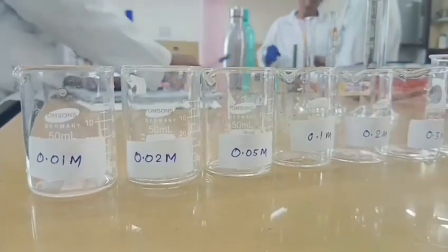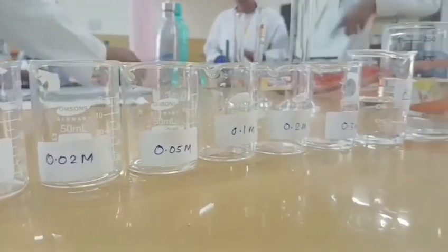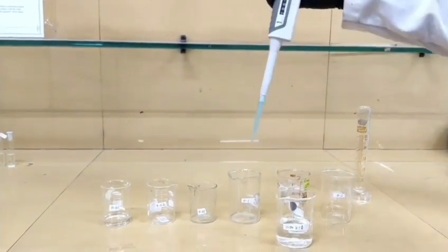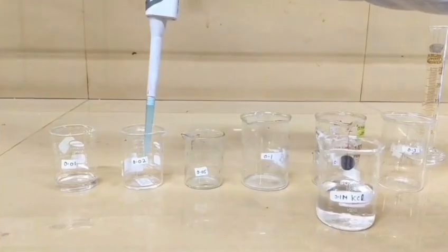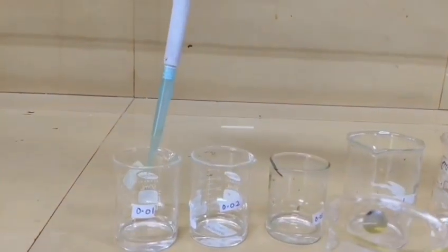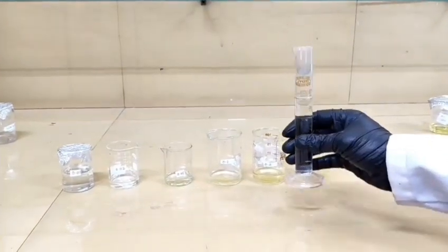Now we move to the dilution part. For dilution we need to take 0.01 molar, 0.02 molar, 0.05 molar, 0.1 molar, 0.2 molar, and 0.3 molar. The quantities to take in the micropipette I have already mentioned in my previous slide.